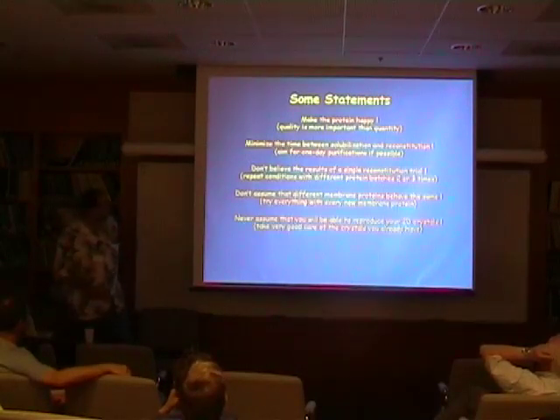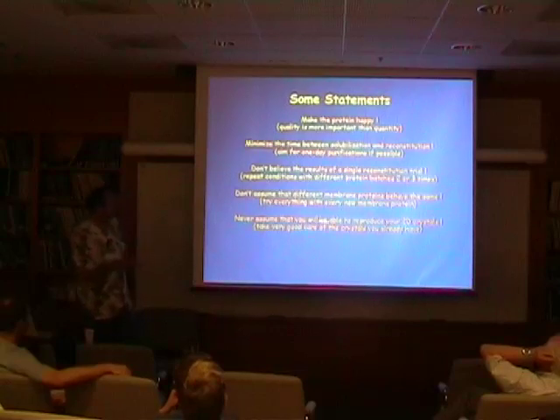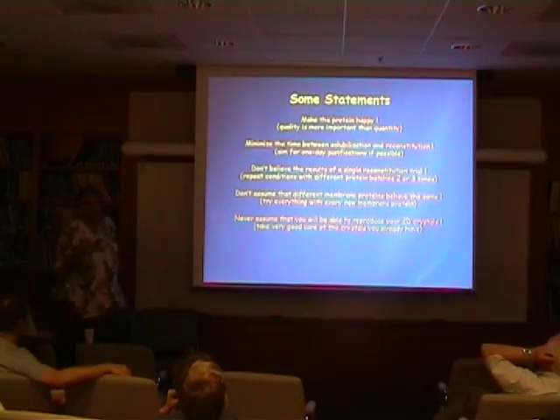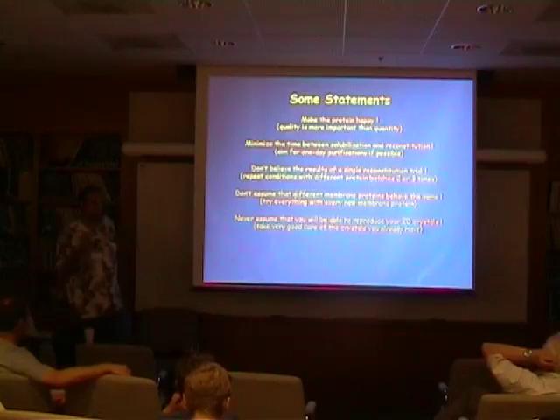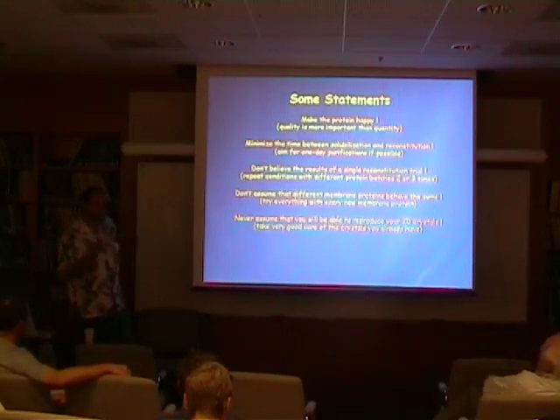And then, so that's another one. Never assume; I really don't believe in reproducibility. So once you have a batch of 2D crystals, it's worth more than gold. You will never ever get it again, so that's your basic idea. If you get it again, and even better, you're very happy, but in the moment, this is all you've got, and treat it this way.